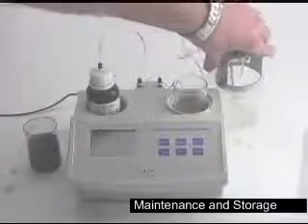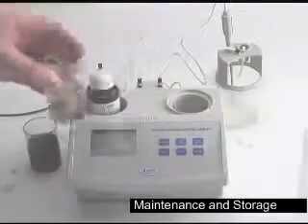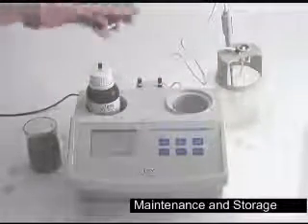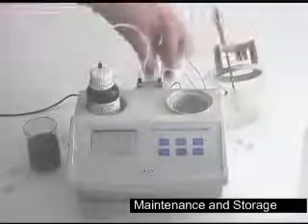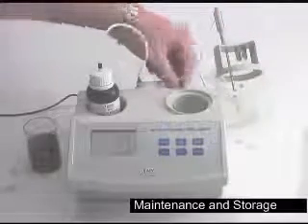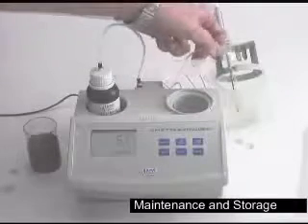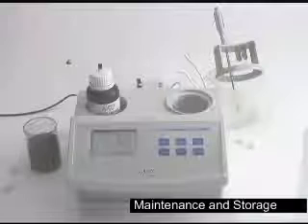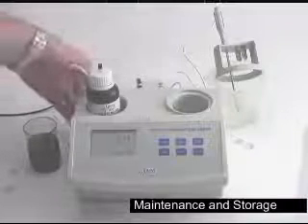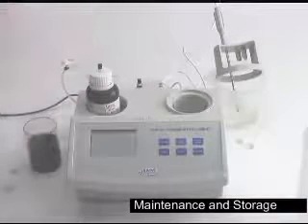You always want to make sure that you remove all your titrant and sample from your beaker. On your tubing, for the longest life possible, you want to unhook one side, again holding the bottom grommet, and then simply place the tip along the side of the bottle. After you're done with that, simply turn the machine off and you're done.